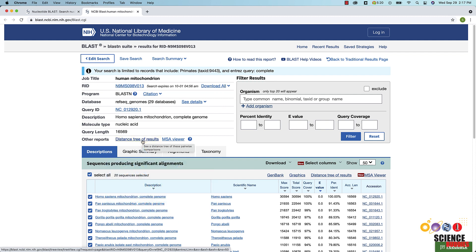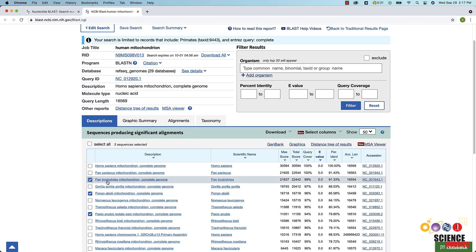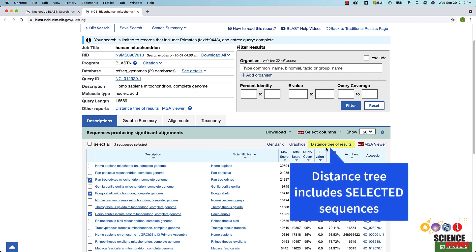You can also create a tree for only a subset of your results. In the results table, select all the sequences you want to include in the tree. Then click distance tree of results above the results table on the right. Clicking this link will generate a distance tree with just the selected sequences.